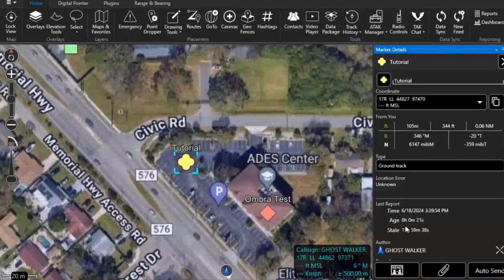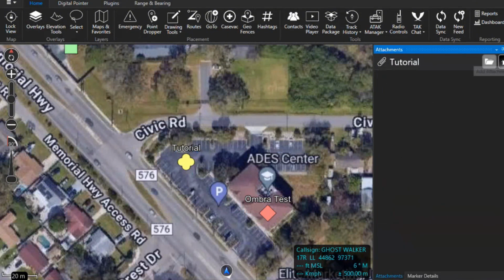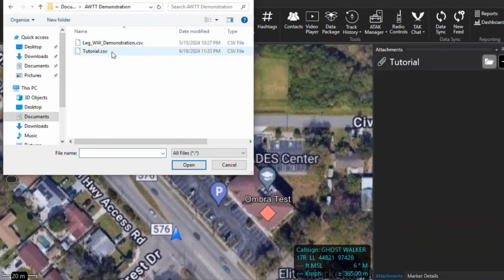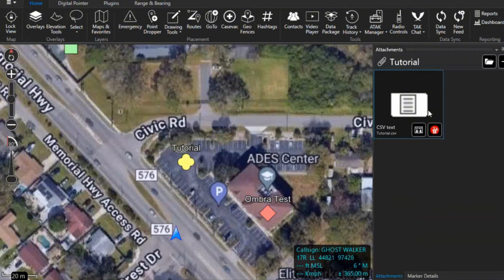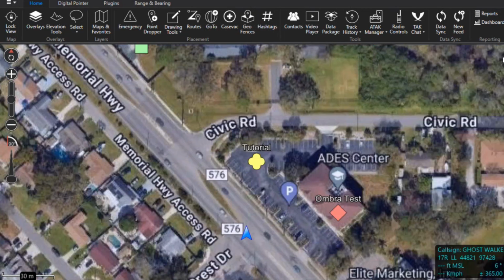If you click the paperclip icon, you will be able to upload files. Uploading the associated CSV report for each experiment on the location of where the sample was collected will allow operators to see detailed information on safe areas or unsafe. Click the top right X to exit the program.